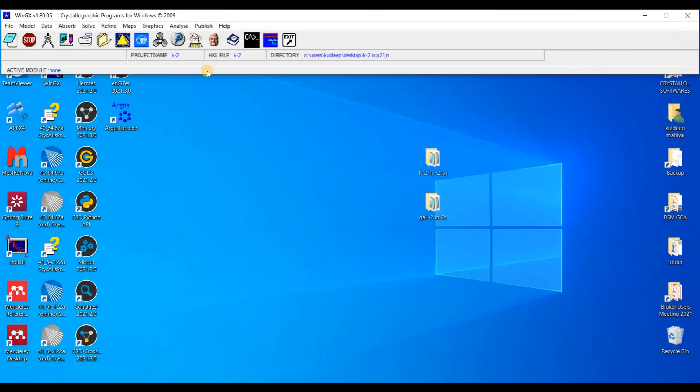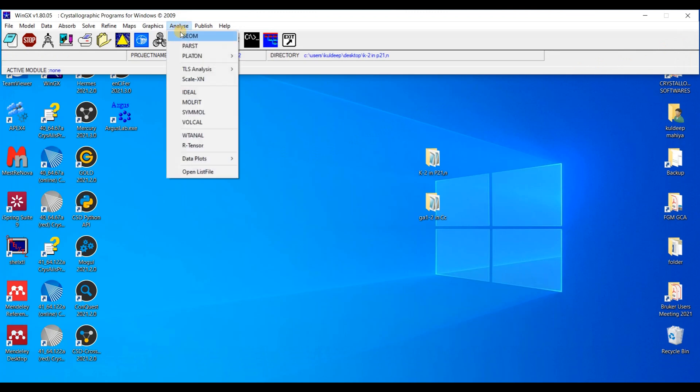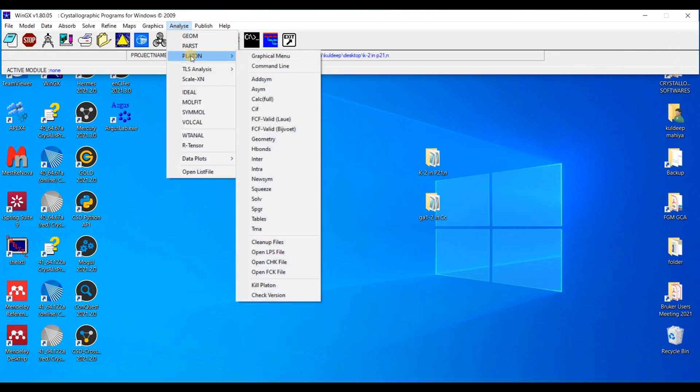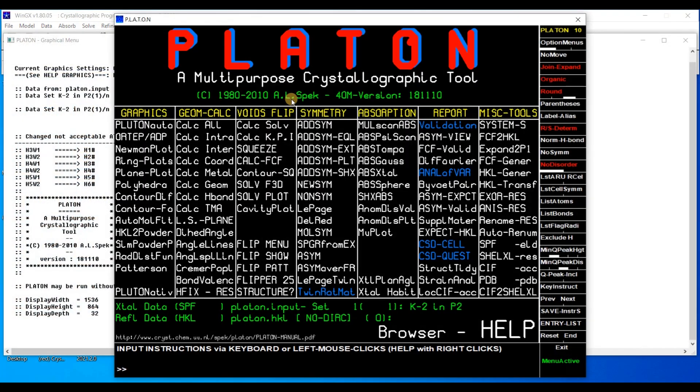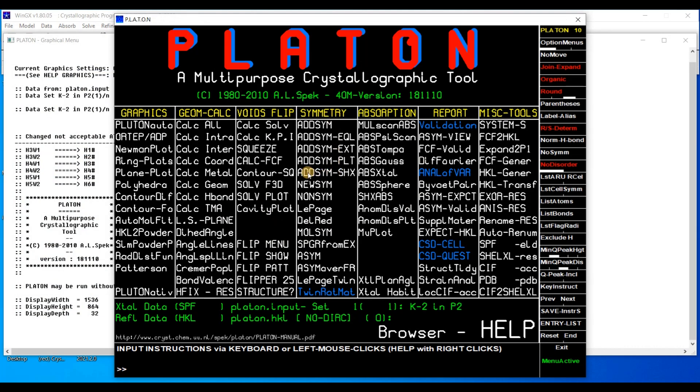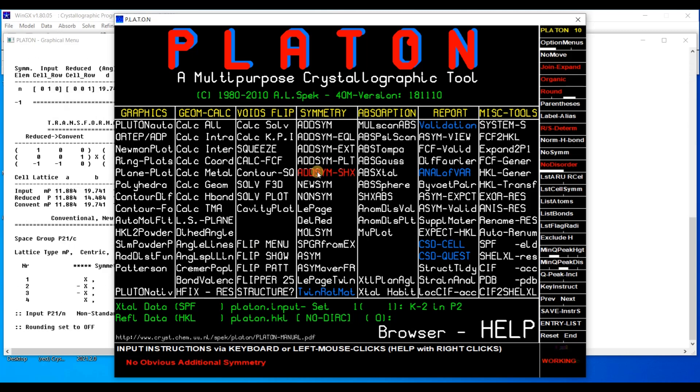Okay. Now go to the button Analyze, Platon Graphical menu. And a window will open up. In this Metric column, we will find an option AdSym shx. Press this one.